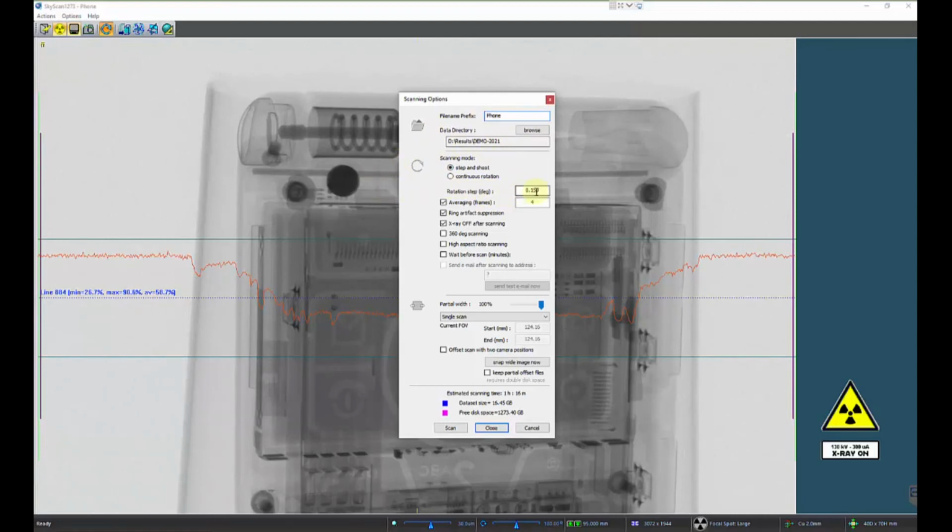Next, we're going to set the rotation step. Again, this is going to be dictated both by the pixel size of your scan as well as how wide your sample is within the field of view. As your sample is smaller and smaller towards the center, you can take larger and larger steps and save time without losing data quality. However, this is a topic to be explored further, and there's a method note referenced in this month's tip article which will give you more details related to that.